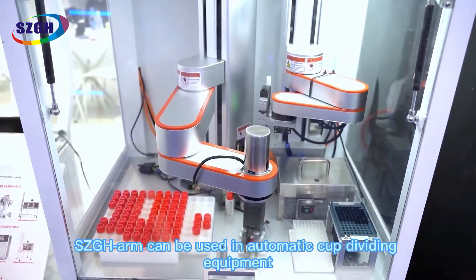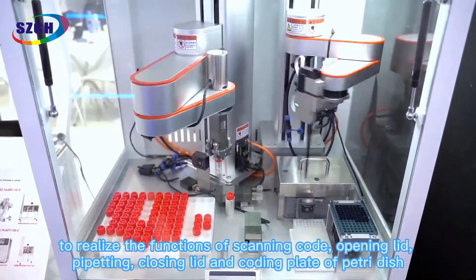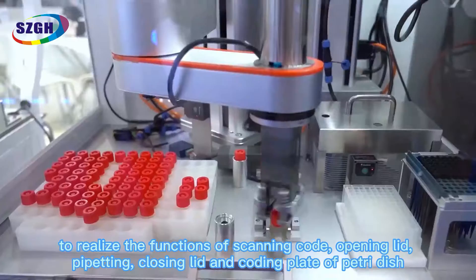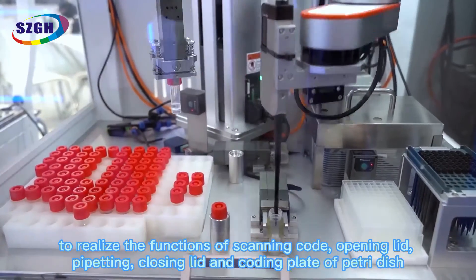The SZGH-arm can be used in automatic cup dividing equipment to realize the functions of scanning code, opening lid, pipetting, closing lid, and coding plate of petri dish.